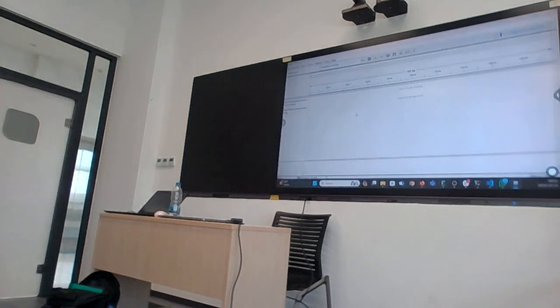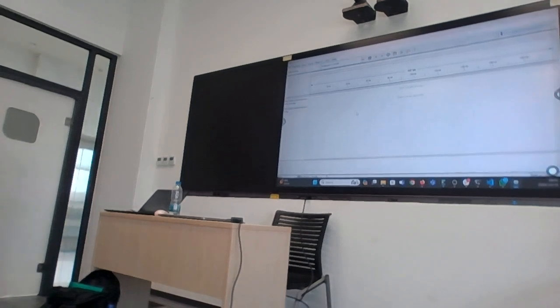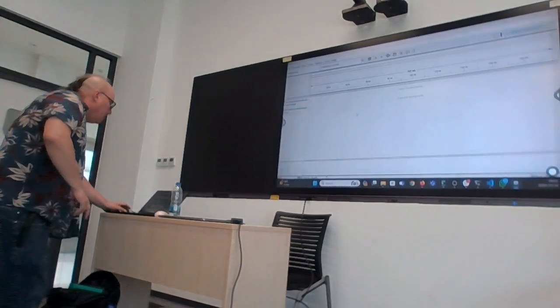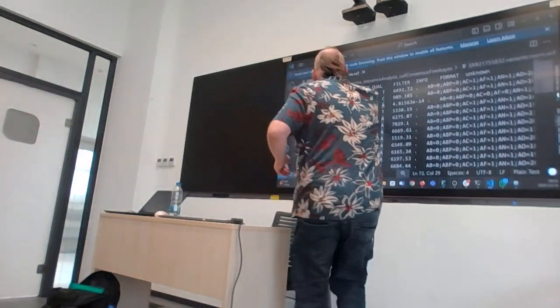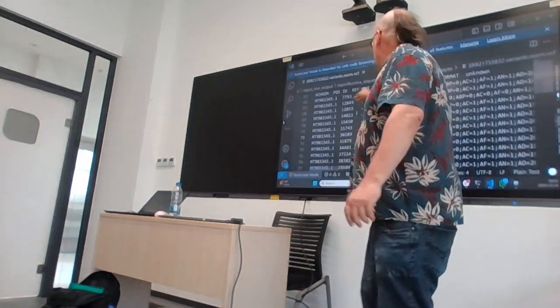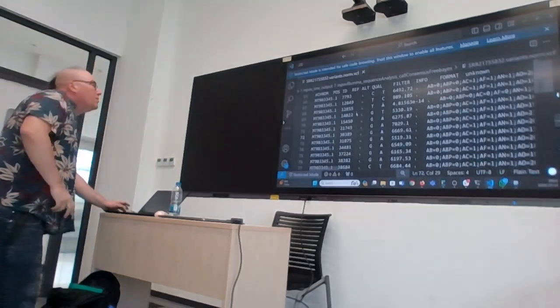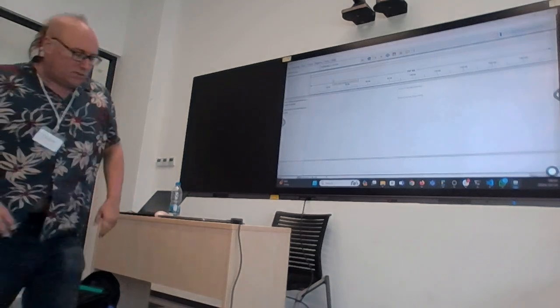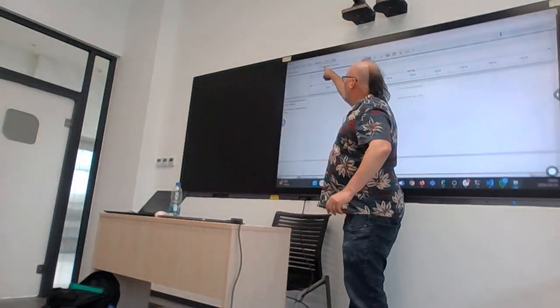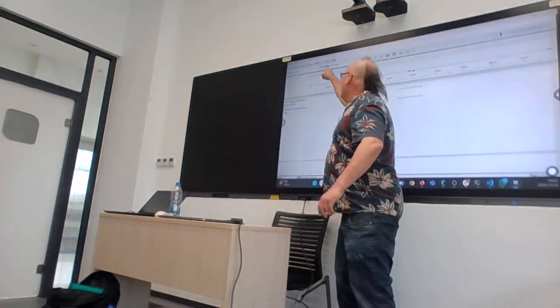But what do we want to look at? Let's look at an area that is interesting, where there is a variant. Okay, so let's go back, I'm going to look at the VCF. Let's look at, for instance, position 12849, because it says there's a variant here, T to C, 12849, okay? So here at the top, you see the name of the sequence, the name of the reference, colon, and the position. So I'm going to delete this.